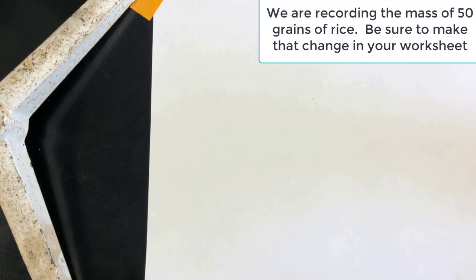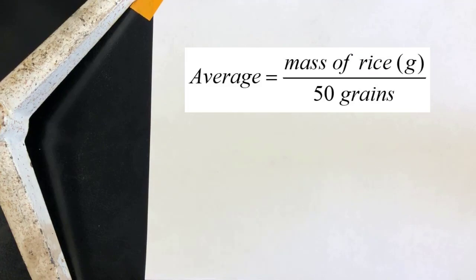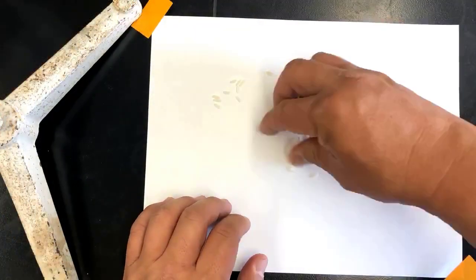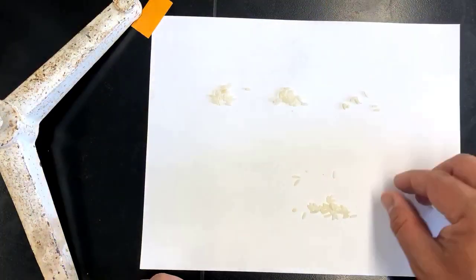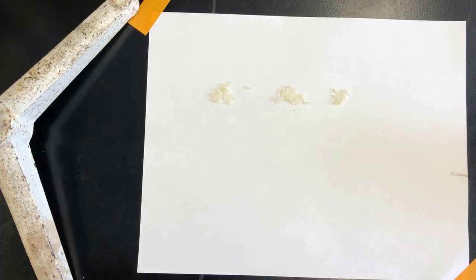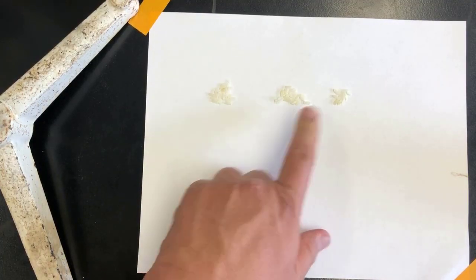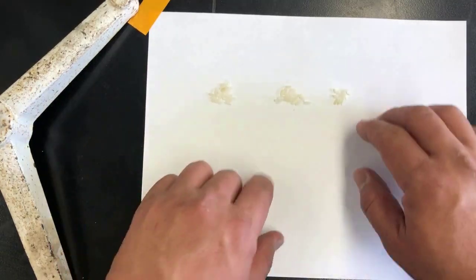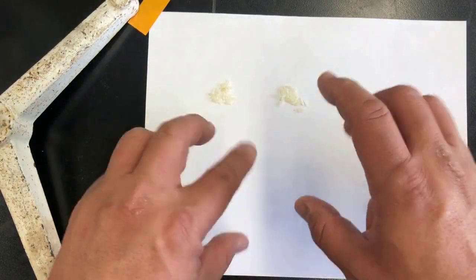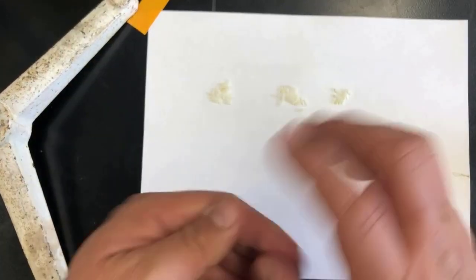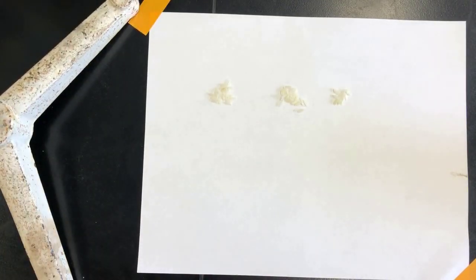Now it says to count out 30 grains of rice, but I'm actually going to do 50, and then we'll use that. That'll give us a little bit better of an estimate. So when you calculate the average mass or the mass of one grain, you'll not divide by 30, but we'll divide by 50. All right, so that is 50 grains. There's two piles of 20 and a pile of 10. There were some broken ones in there, so for some of these I kind of put little broken pieces in there, but I'm trying to get it to be four whole grains of rice.